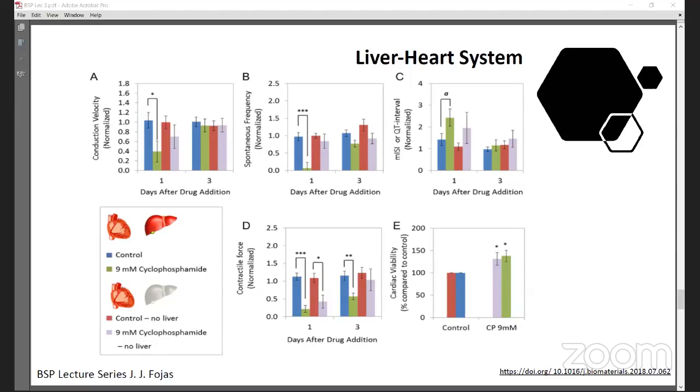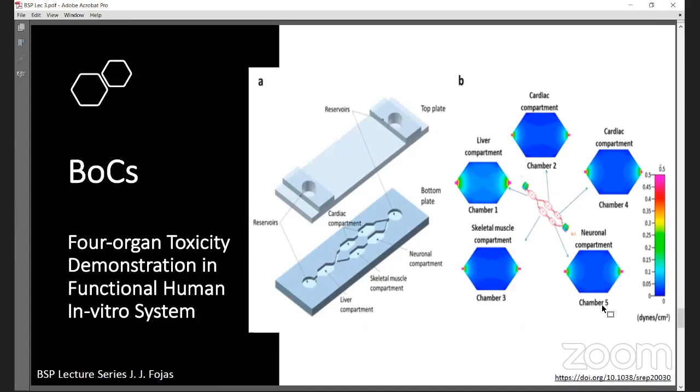Okay, so let's take a look at the last one. The last one is another toxicity study. I've mentioned before, again and again, drug discovery, drug screening. And one of the critical aspects of drug screening is toxicity tests. So is it cytotoxic? The high failure rate of drugs at late stage of development contributes significantly to the increase in costs, as well as delays in the development of new and more effective clinical treatments.